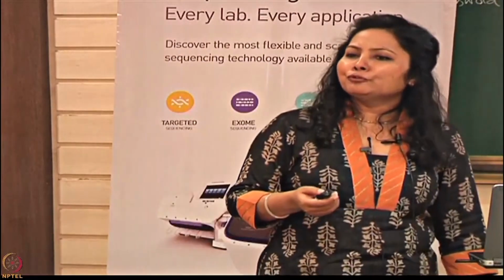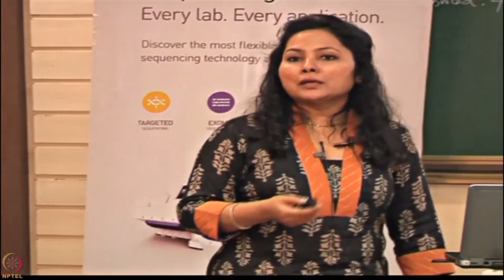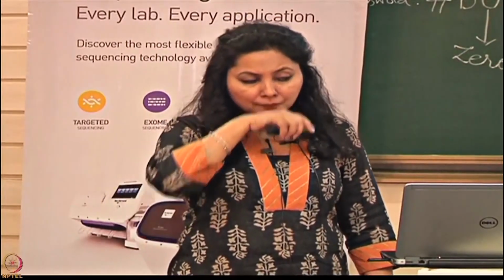The process generally for targeted sequencing or for whole genome sequencing is around 4 to 4.5 hours for manual, and probably for RNA-seq it's a day's protocol, because you have to do certain levels of enrichment and you have to do more QCs in that.